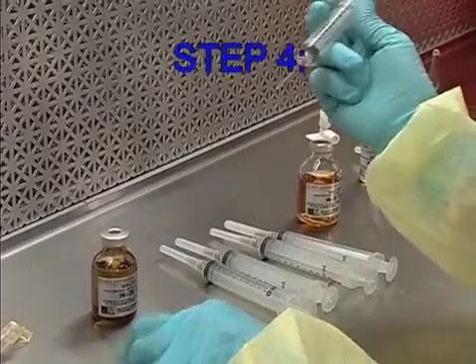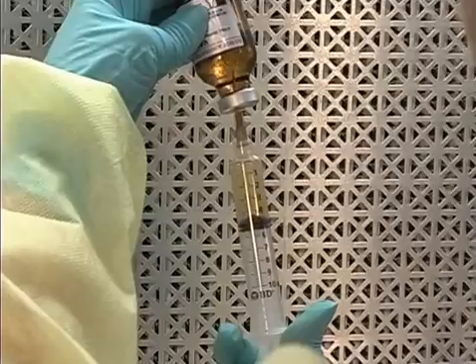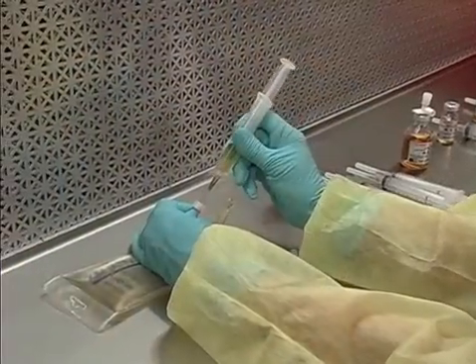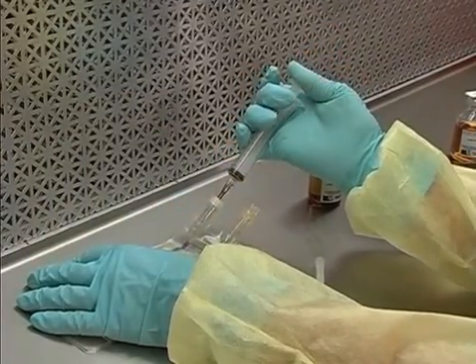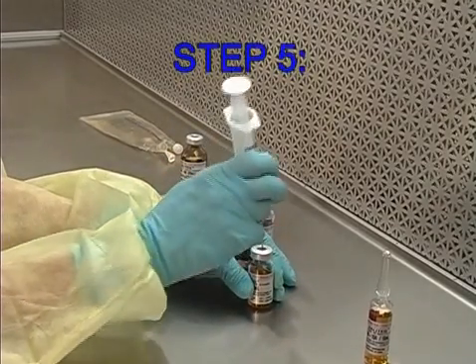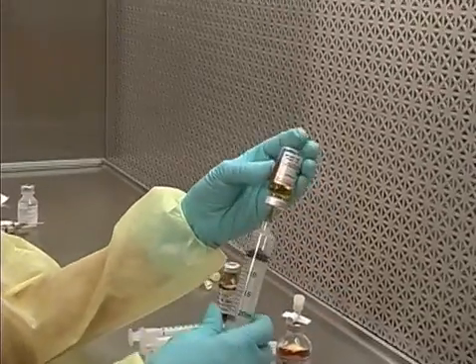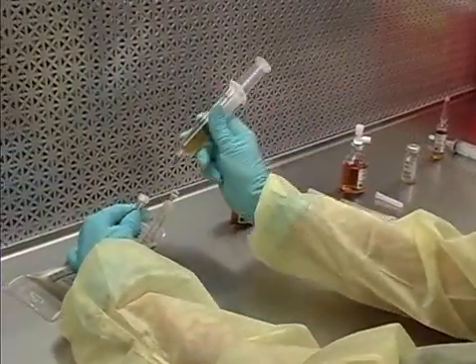Step 4: Using a 10-ml syringe, withdraw 5 ml of VM-20R from the reconstituted vial and transfer into the final container. Step 5: Using a 20-ml syringe, withdraw 10 ml of VM-10 and transfer into the final container.